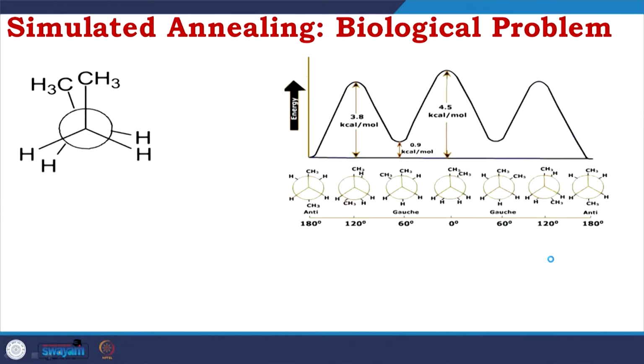This is what I talked about in protein. So, I do not use a model again, you already know the N-butane, when you move the conformers, you get different maximas and minimas.